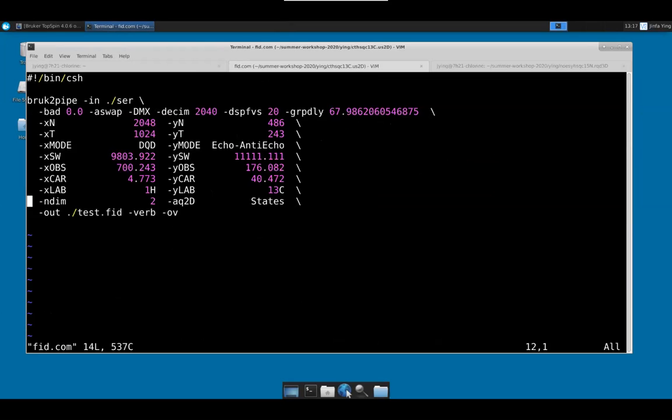Frank tried to be consistent with that, and this older script doesn't have it. If you don't compare the data, you don't need a scaling. The scaling is really when you compare two different spectra, or the same protein in two different spectra. And then you do scaling and then it should be the same.